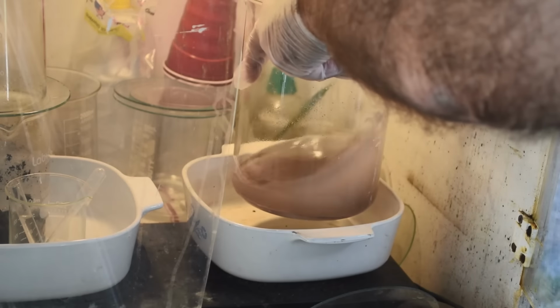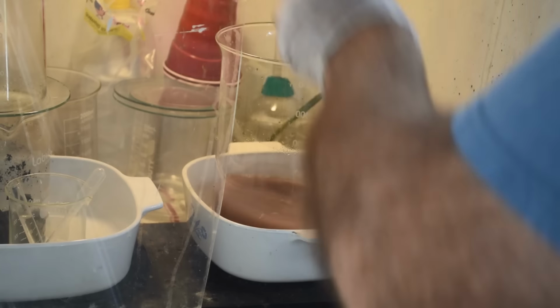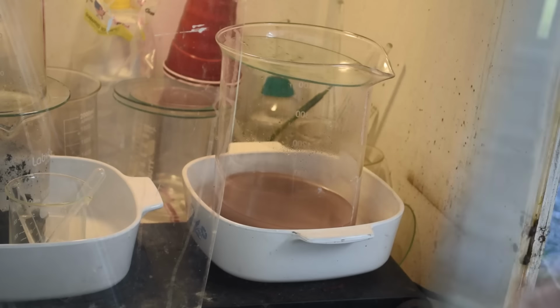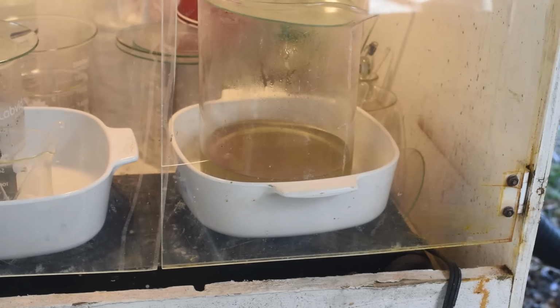Give it another little swirl. I need bigger watch glasses for beakers this big. Let's turn some heat on it, warm it up, see if we get any kind of reaction going here. And hopefully we'll get some golden solution. That would be nice. So we'll just let it cook for a while and see what happens. Well, we got some bubbling going on in there. I'll take that as a good sign, since this isn't anywhere near hot enough to be boiling yet. It's only been a few minutes.